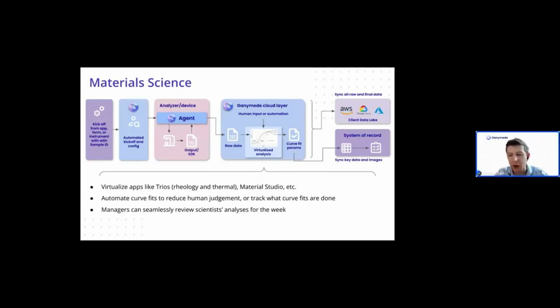So this is where this becomes powerful, as well as if the data and the file formats from the vendor, from the instrument manufacturer are not open, now you can effectively coerce them into being open by automatically opening something in virtualization in the background and then exporting it as something like a CSV or whatever their export format is. So hopefully that gives you a good idea of some of the use cases.